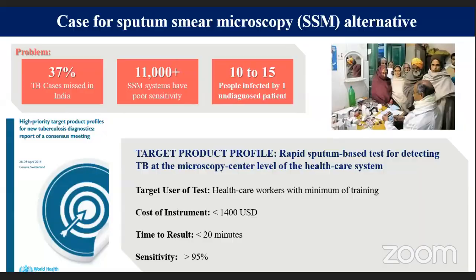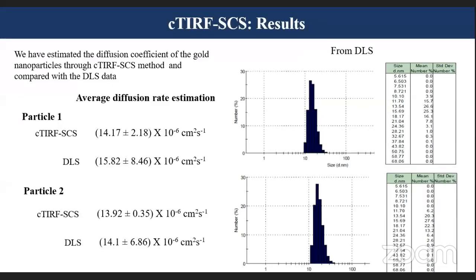And this kind of setup costs a very small fraction of the actual instrumentation we use for observing diffusivity, or for total internal reflection fluorescence microscopy imaging.